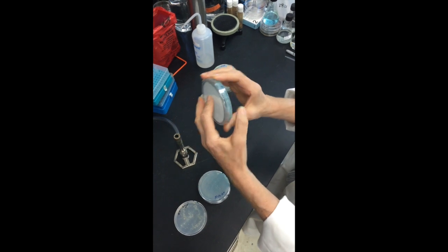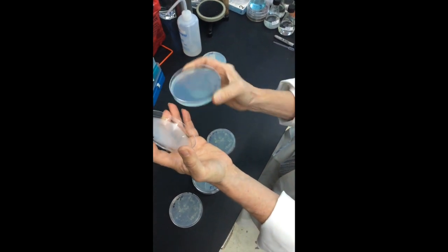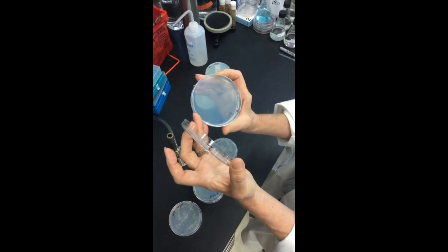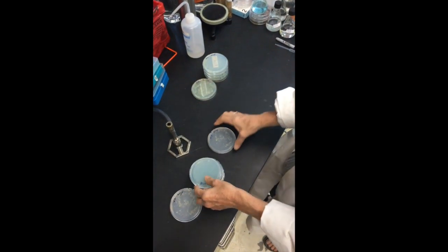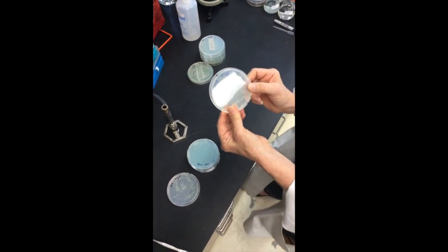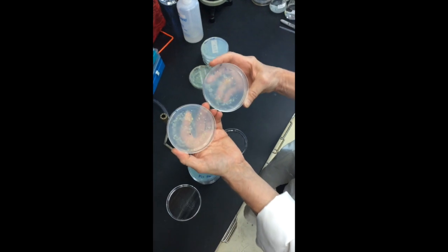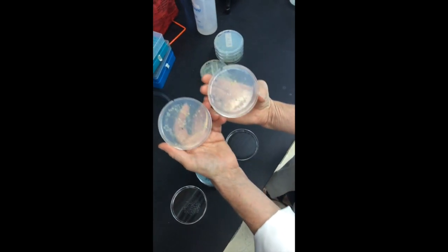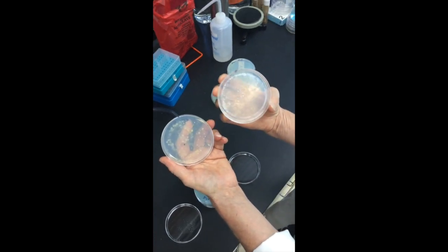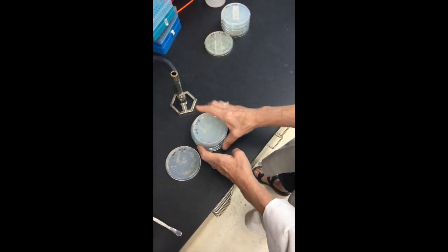And then here is our plate that had 2 millimolar copper on it, and you can see it's got kind of a bluish green tinge from the copper, and almost nothing grew on that. There might be one little colony up there at the top, but we'll continue incubating to see if it grows. And then if you look at the last plate that we did, this was a plate that had no copper on it, and it should be almost identical to the original one if the Xeroxing worked. And I'll try to line these up properly. And you can see that even though there's a little bit of smearing, most of the things that were on the original plate show up in the same position on this other plate that we did. So that's the replica plating.